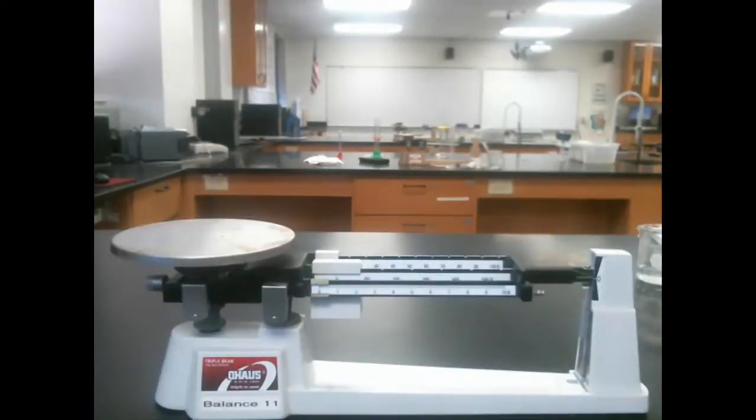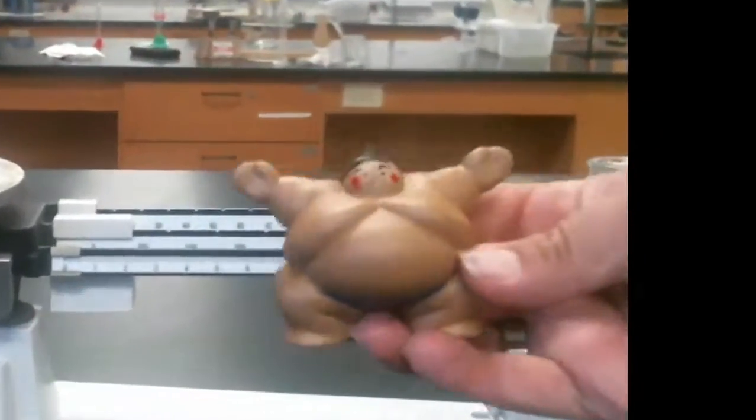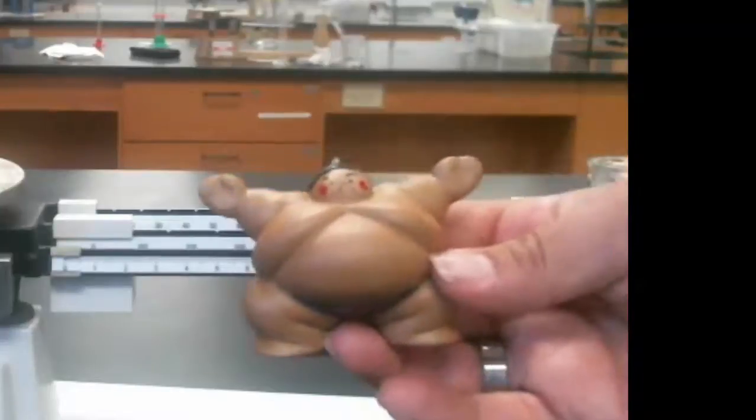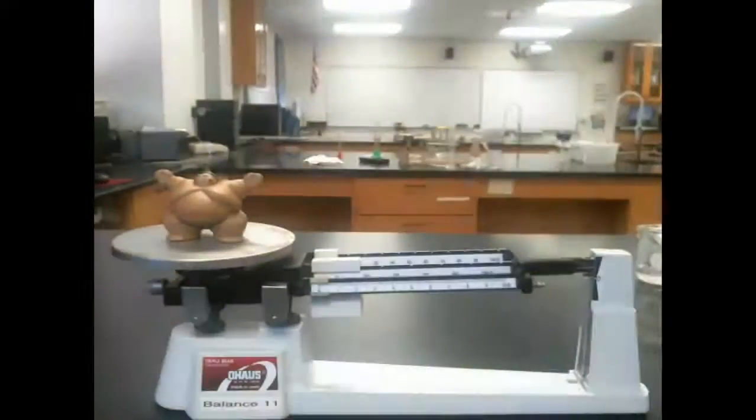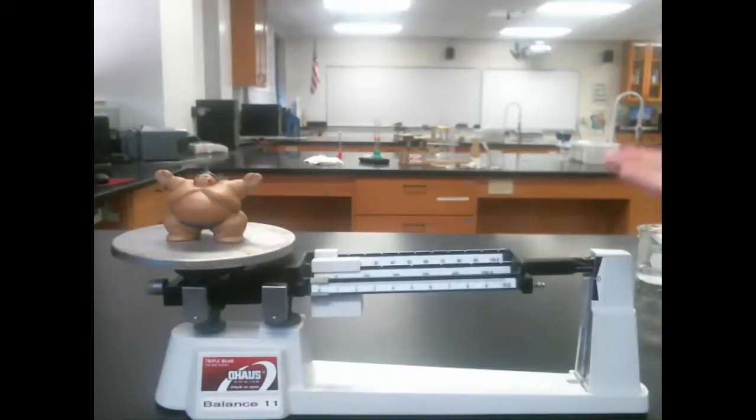Now, for the sake of this video, I'm not going to spend too much time on that because it can get a little time-consuming. We'll just assume that this is good to go ahead and measure. You need something to measure. We're going to use Mr. Sumo Wrestler here. I got him in Japan. We're going to put Mr. Sumo Wrestler right on the balance pan. Now, you can see, because he's a Sumo Wrestler, he's fairly massive, and the balance arm went right up and is now stuck against the top.